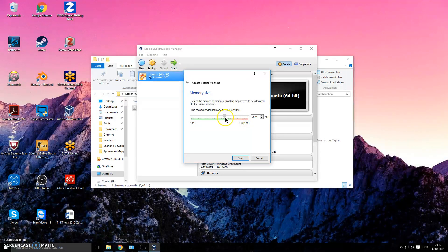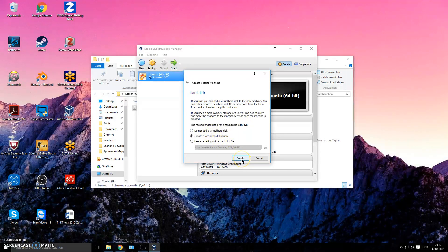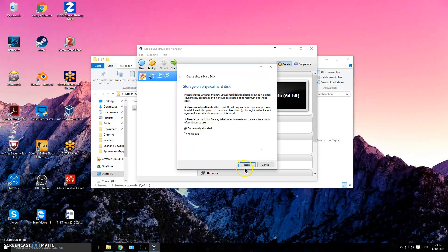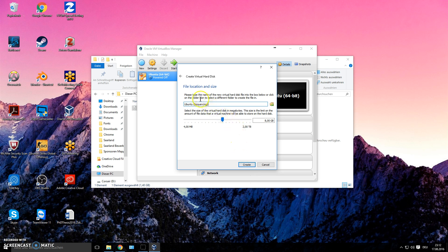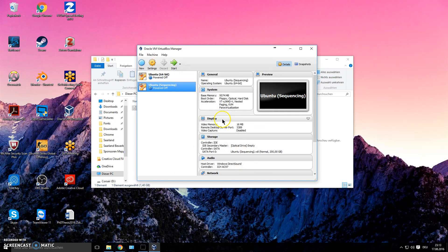Try to stay in the green zone for memory allocation — don't go into the red. Choose an amount that fits what you want to do with the VM. Then create a virtual hard disk: VDI format and dynamically allocated are both fine. For the disk size, I recommend going as large as you can for sequencing, because you'll have huge files. I'll stick with 200 gigabytes here — even two terabytes can be not enough for heavy sequencing analysis.